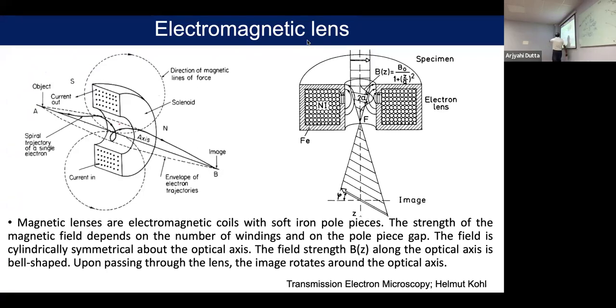So if you look at this, this is the ray which is going through the optical axis. There is no deviation, it will just go straight. But there is another ray which started in this direction, and as I mentioned, with the right hand thumb rule, there will be a deviation in this direction, and you can see it started bending. The same thing is going to happen when it comes from this direction, it will push towards that. So if there is an electron beam, it will enter the magnetic field, go through like that and converge in one point.